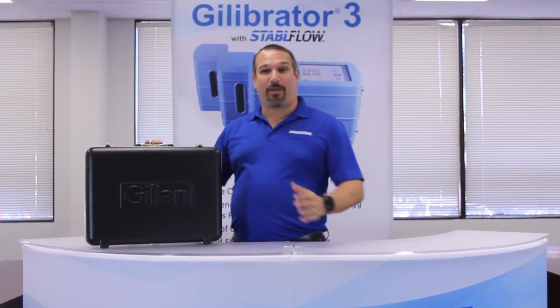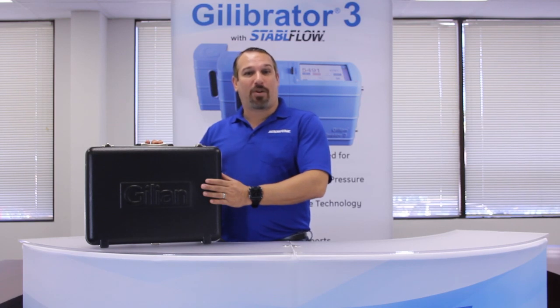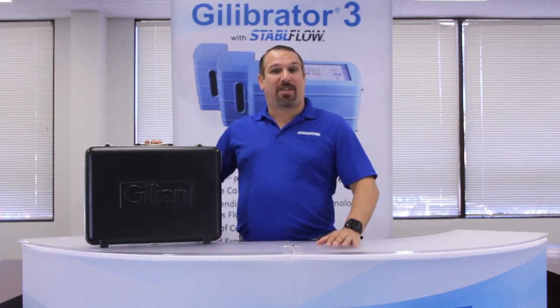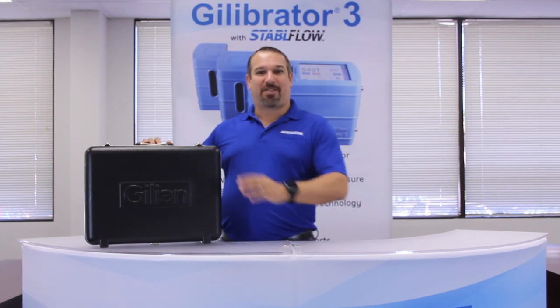Welcome. This is a video and overview of the Sensodyne's new Gilibrator 3 DrySol Calibrator. We'll cover what's included, how to set up the calibrator, review of the capabilities and functions of the device, and demonstrate how to properly use your calibrator. Additionally, we'll cover safe handling and storage, as well as the annual maintenance for this device. Let's get started.